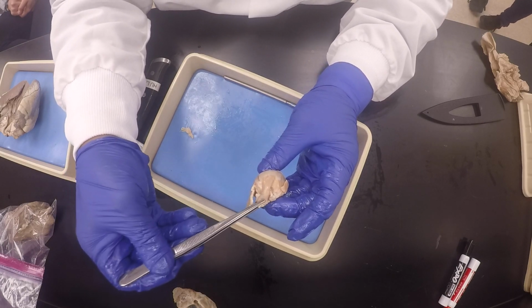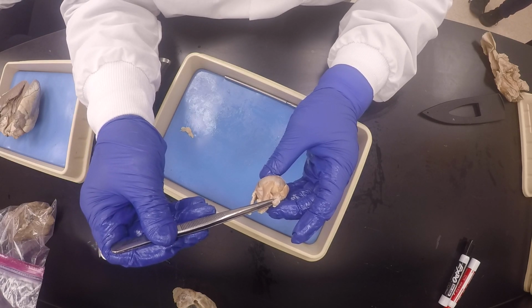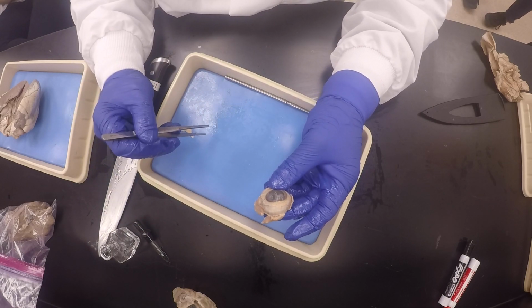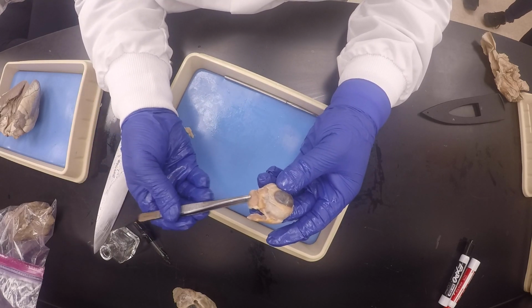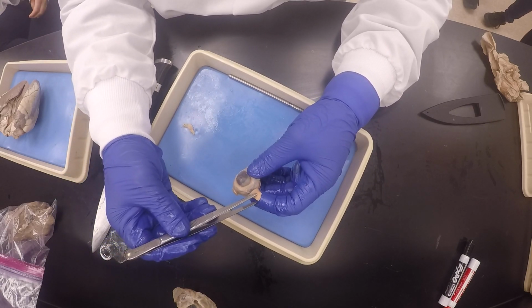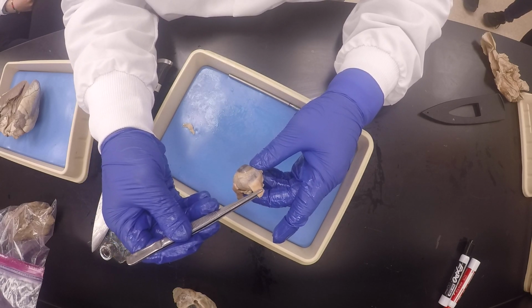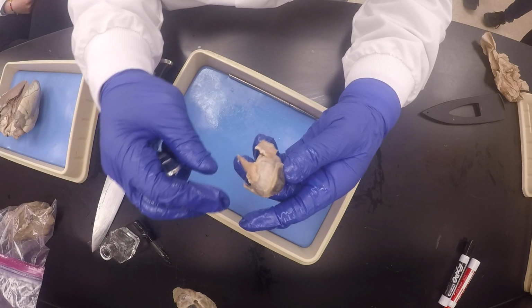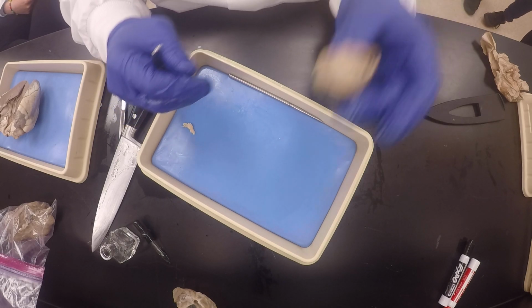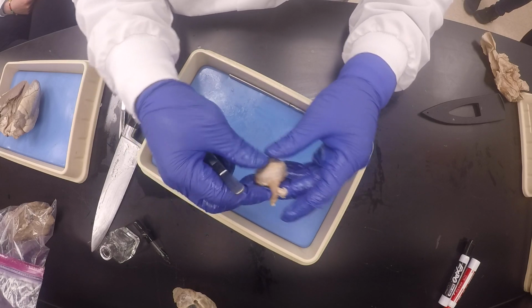Okay, so this is the superior rectus, and the one at an angle is the superior oblique. So you confirm indeed that this long side is the superior. Since we said this is the lateral rectus, this is going to be the medial rectus. And you will confirm that indeed is the medial rectus because there will be no other muscle there. It's only by itself, because this is the one by the nose bridge. So we know this is the left eye. You understand? Bless you. Okay? So you see what I'm saying, my good friends?